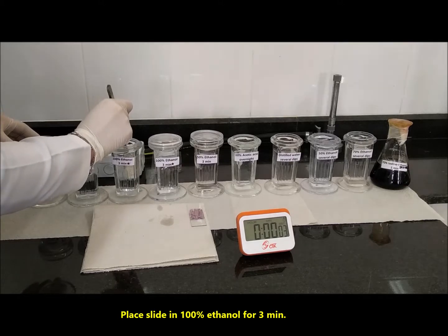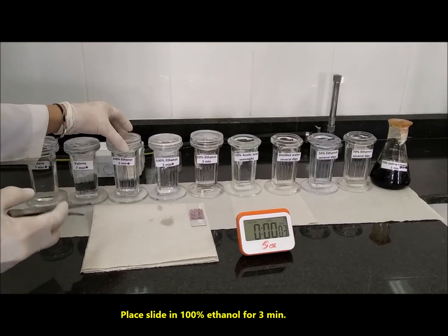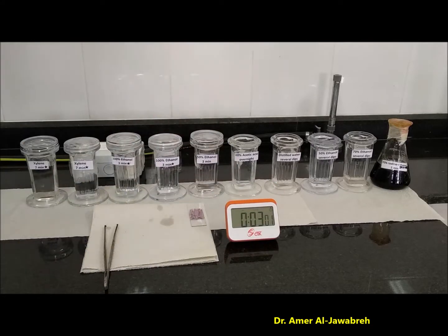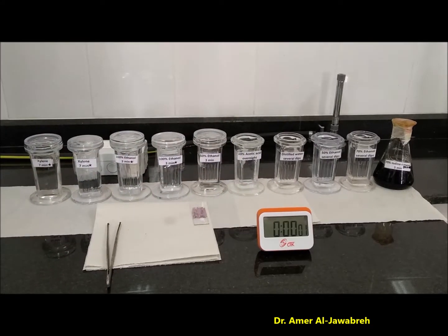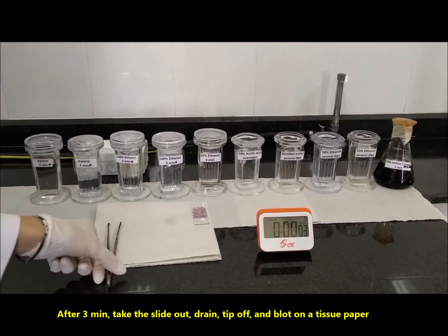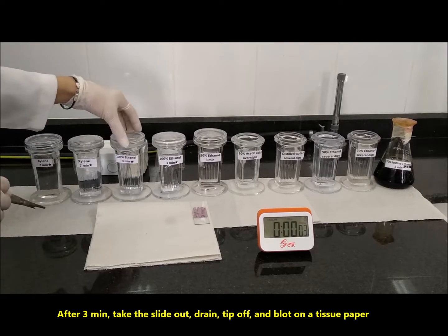Place the slide in 100% ethanol for 3 minutes. After 3 minutes, take the slide out, drain, tip, and blot on a tissue paper.